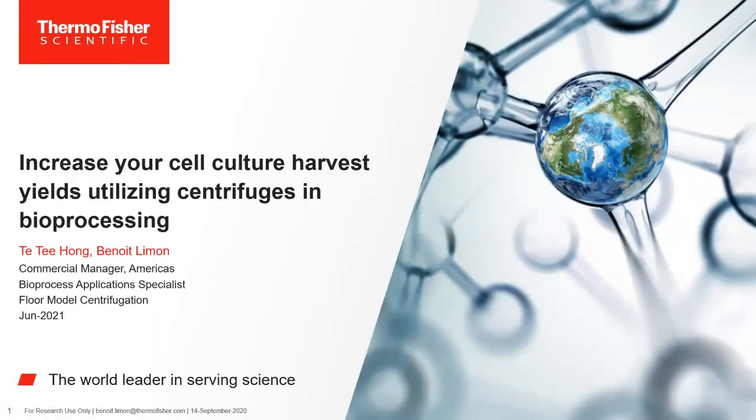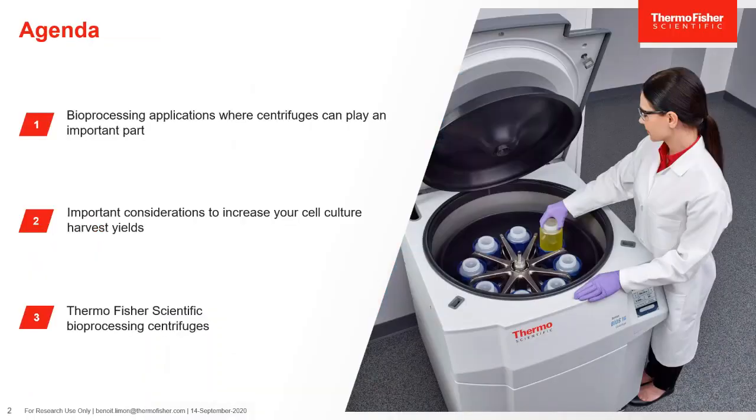Welcome, everyone, and thanks for attending our session today. We'll go ahead and jump right into it. We'll begin today by identifying applications where centrifugation can play an important role in the bioprocessing workflow. We'll follow that up by reviewing the important considerations when deciding what method of separation to utilize during the harvest stage. Finally, we'll finish up today's talk with Thermo Fisher Scientific centrifuge product offerings, which will help you attain these higher harvest yields.